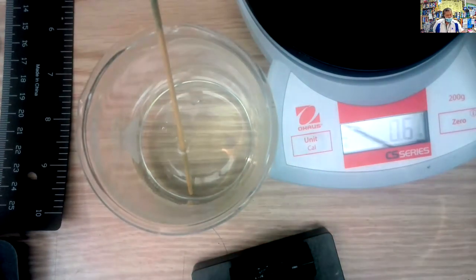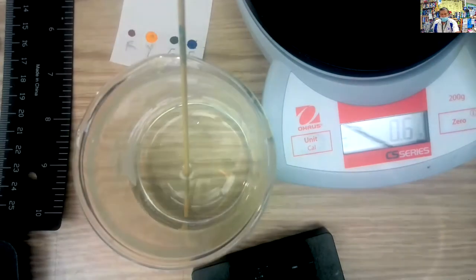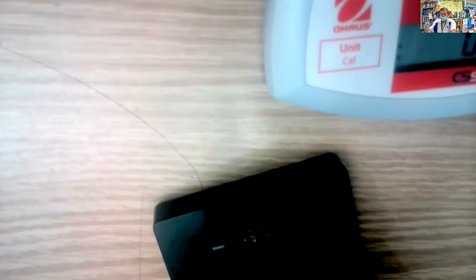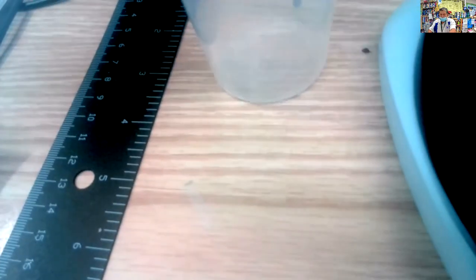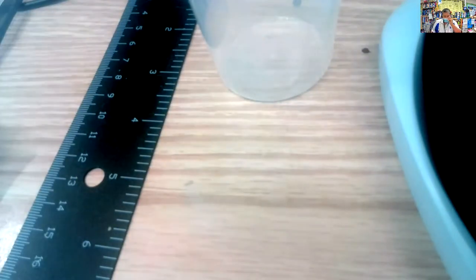And while those are dissolving, we're going to go ahead and take this guy right here. I'll show you what we're going to do before we do it. I have another cup. If you're a Gorman student, you have one of these in your lab kit. If you don't have one of these, if you're just viewing this for fun or in lieu of an in-class lab, you just need a glass beaker about the same size. This one's a 250 milliliter beaker. You could use that, or you could use an old spaghetti jar or something.